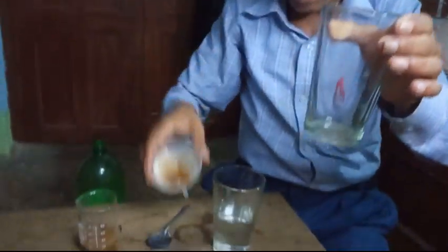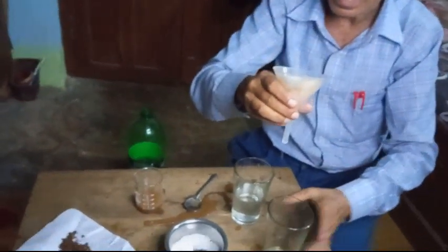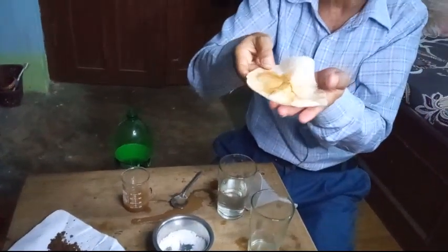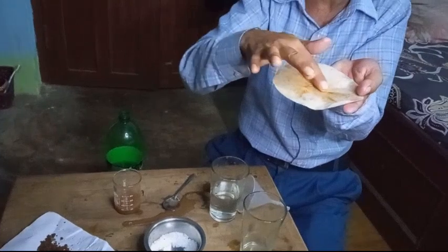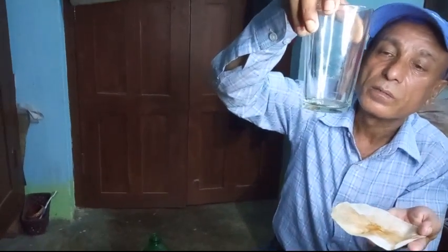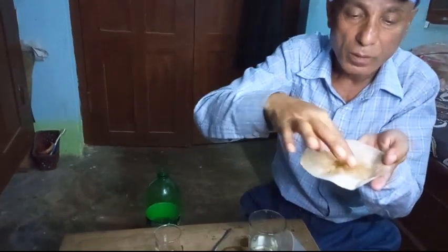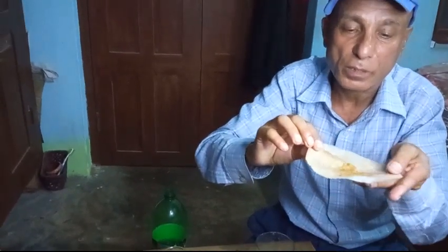Now, what is this water called? This water is called filtrate. The water obtained after filtration is called filtrate. And see, some insoluble solid particles are left on the filter paper. This is called residue. What is this called? Residue. The clean liquid is called filtrate. Filtrate is the liquid obtained after filtration. Residue is the insoluble solid particle left on the filter paper.